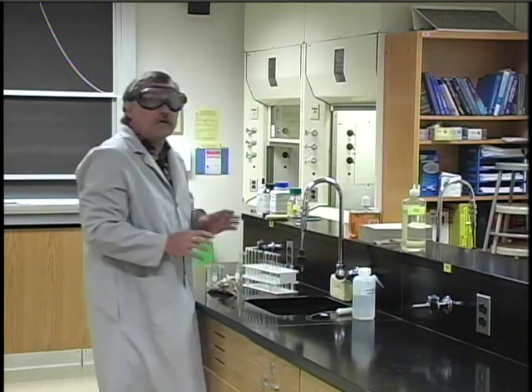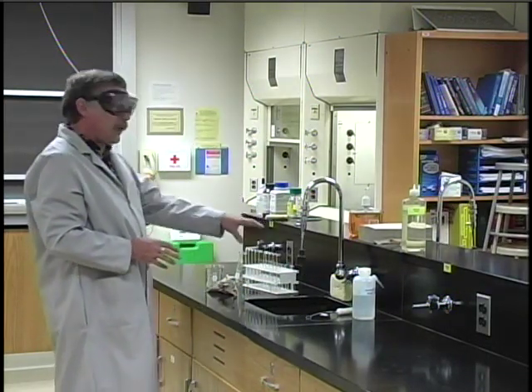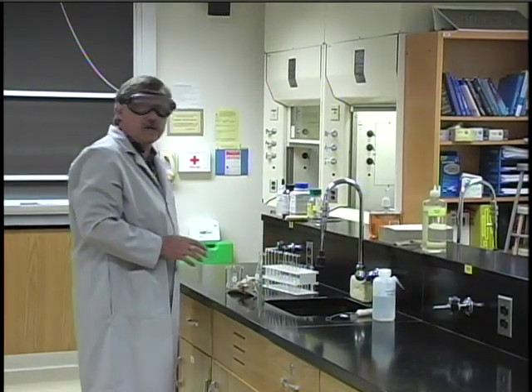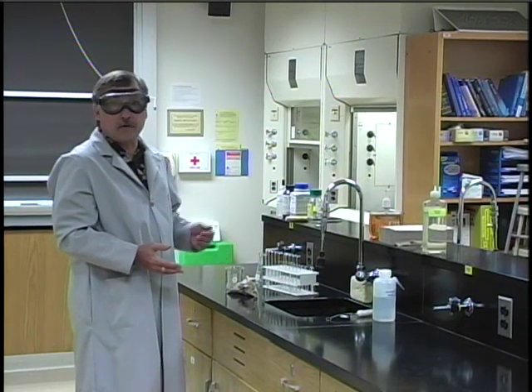Remember, under no circumstances is it ever okay to put dirty glassware or glassware that has chemicals in it back into your lab station. If you get it dirty, you have to clean it up before you leave.